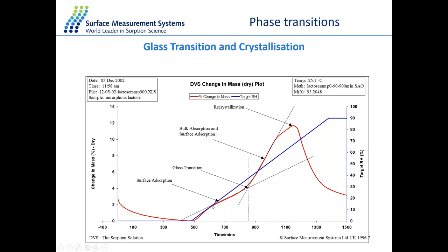At a certain level of relative humidity, there are enough molecules that the surface of the sample, which is obviously glassy at the beginning, moves to a rubbery condition because the solvent that we are adding is acting as a plasticizer. Once the sample surface has moved to the rubbery condition, then molecules can not only absorb on the surface, but also penetrate through the bulk. Once the molecule reaches the bulk, we have our bulk sorption. Because we have bulk sorption, now we are able to absorb much more molecules. So it's faster right here. Sorry, right here is faster than it was before.